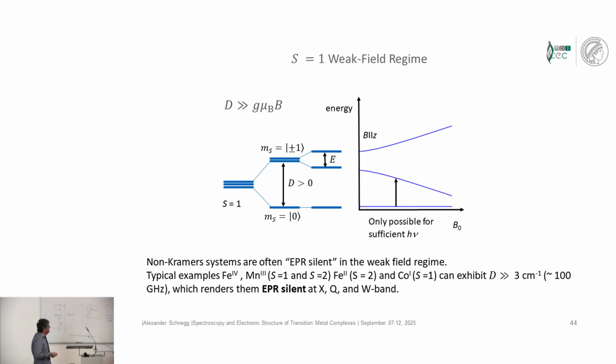And in these cases, the most powerful approach is a combination between squid magnetometry and high field EPR. This is what I think has been established as the best method, because squid magnetometry, as Dan outlined, gives you a very nice overview over your system, and if you can then validate your parameters which you're assuming in your squid simulations with resolution in an EPR spectrum, you can be pretty safe that your fits are reasonable.